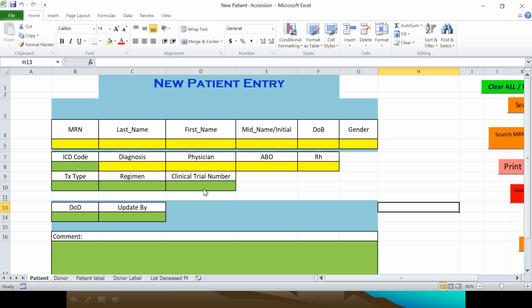So later you can easily search the subject by this extra information. Also, the information can be updated later. So this leaves some option, either to do a correction or make a change due to the patient's situation changing. I think that's good for the collection form here.